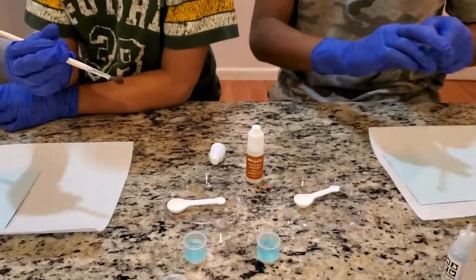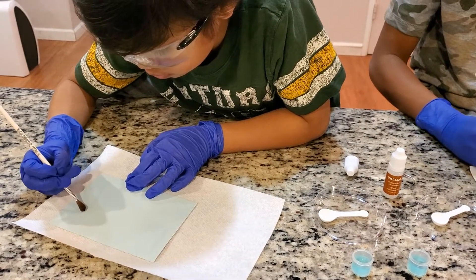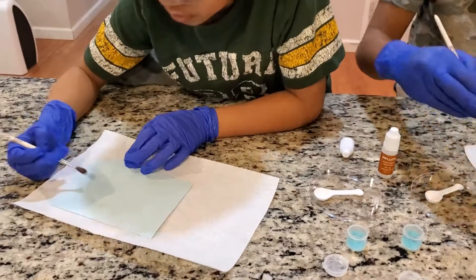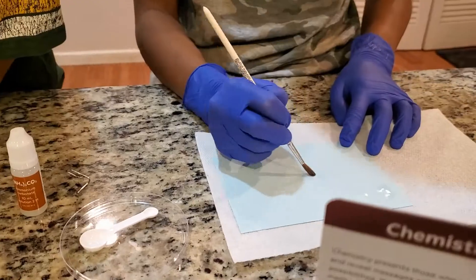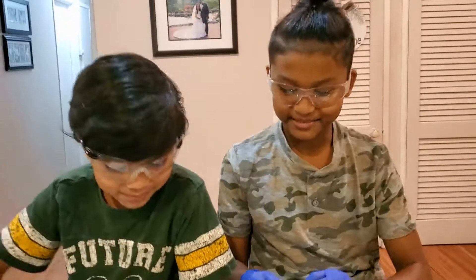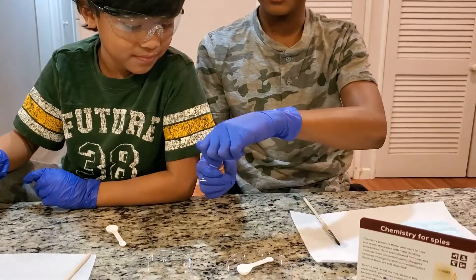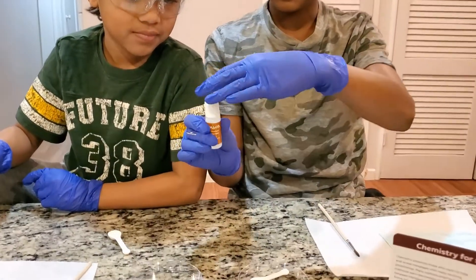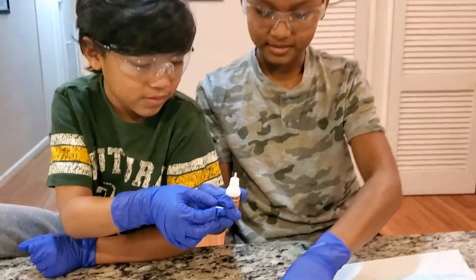Let's write our secret messages. So we're going to put ammonium carbonate — it's brown. Well, the thing is brown but I think it's clear. Into these things.